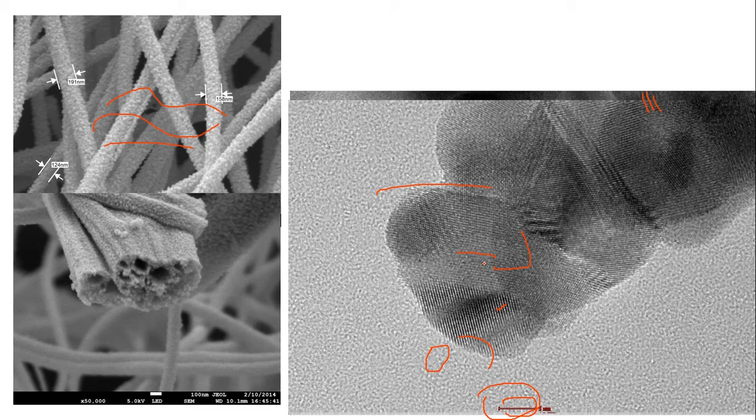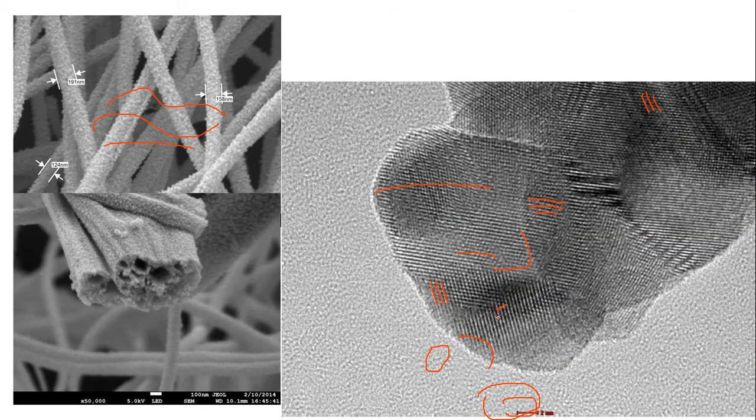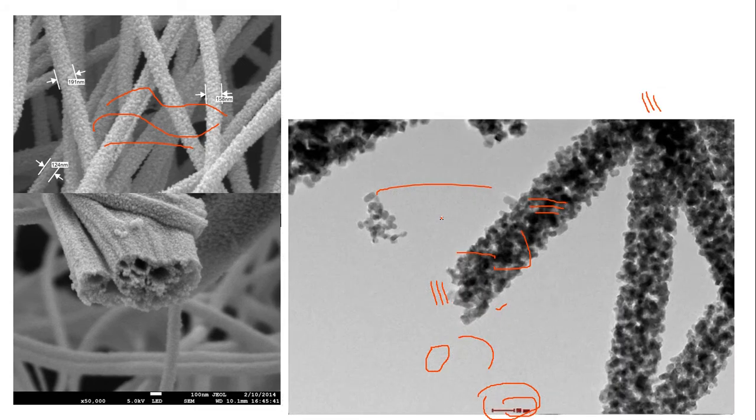So now you can see here that in a specific grain, the planes are oriented in one direction. Here you see, this is oriented in one direction, here it is oriented in this direction. Now we further zoom. So these are basically the transmission electron microscopic images.